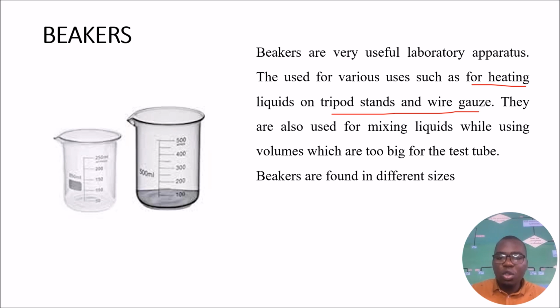They are also used for mixing liquids while using volumes which are too big for test tubes. Beakers are found in different sizes as well. So please take note of this one. Beakers are multi-purpose. They can be used for heating liquids. They can be used for mixing liquids while you are using volumes that are too big for test tubes.